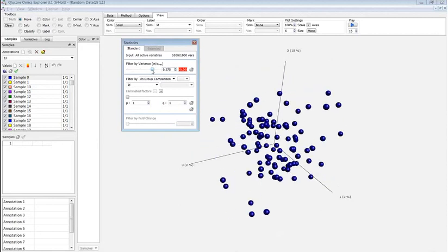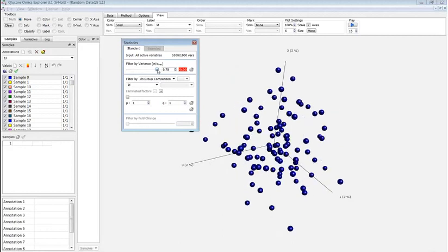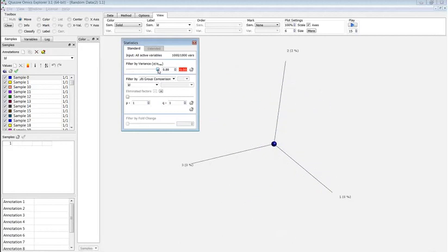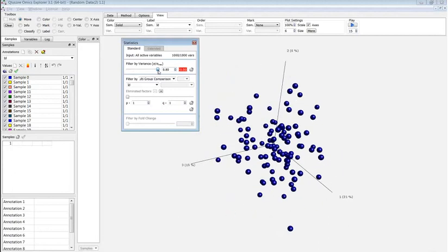That is because, as we define projection score, we take the fraction of the variance and subtract the fraction of variance for a completely random data set. And of course we have two completely random data sets in this case, and the difference will be 0. So no matter how much we filter, we will still have no structure in our data. This is a projection score of 0, or close to 0.